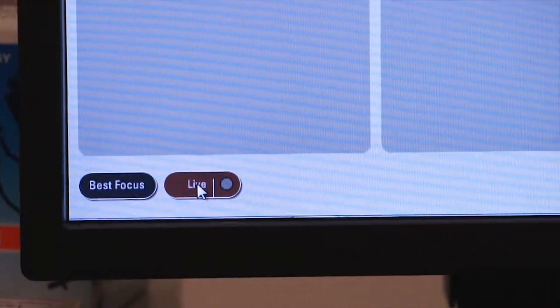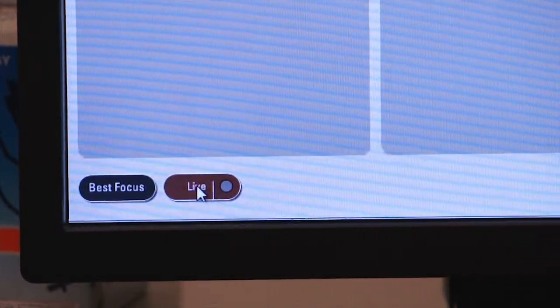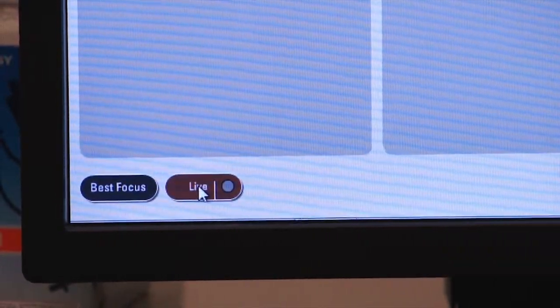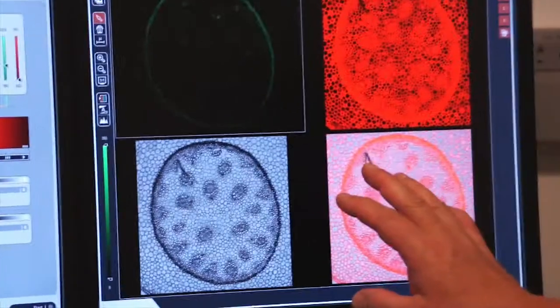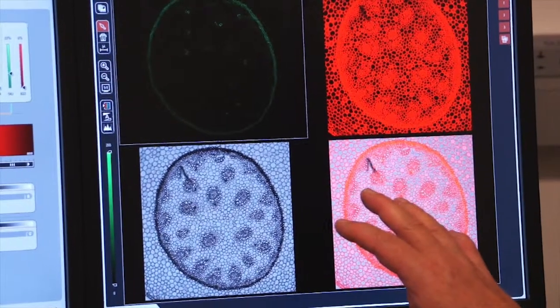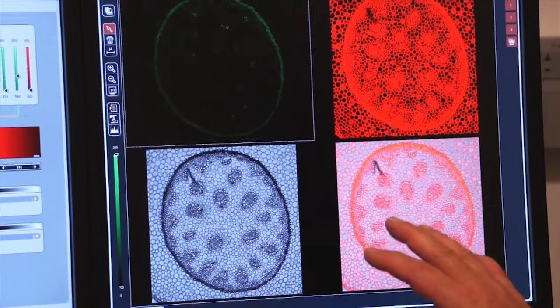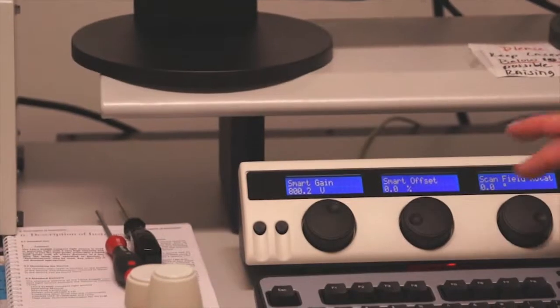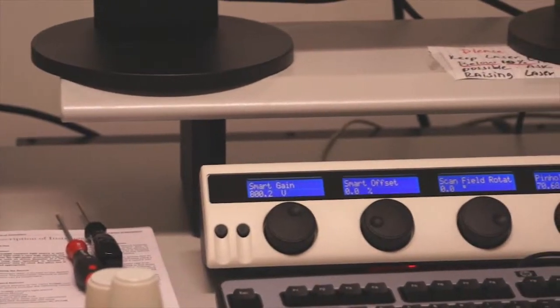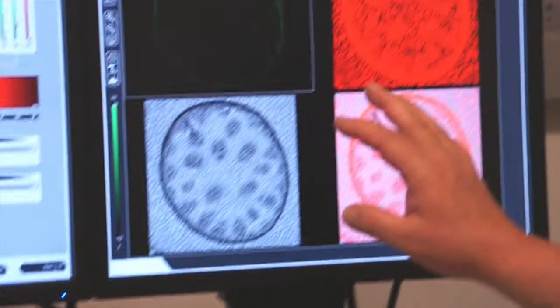So to look at my live image I'm going to click on the live tab and once I click on it I can see that I have a live image on the screen. At this point I can control my smart gain and my offset and make sure that my image is well balanced.